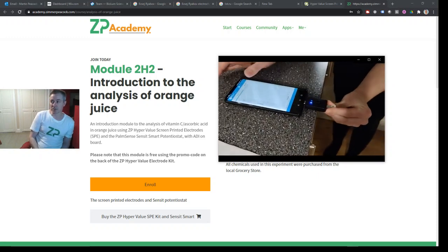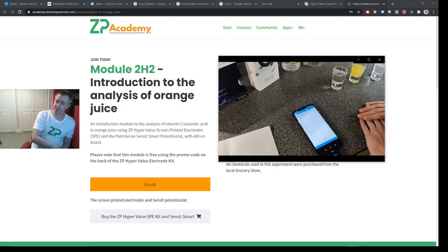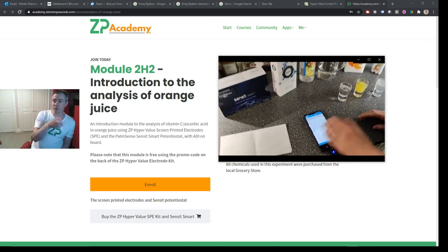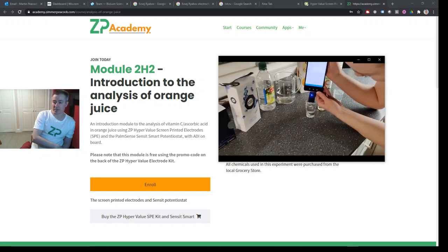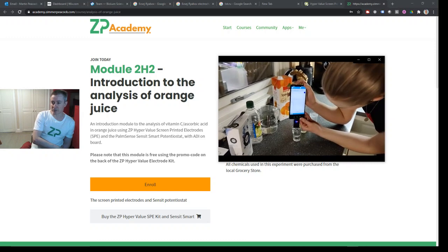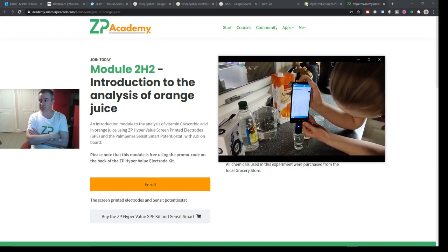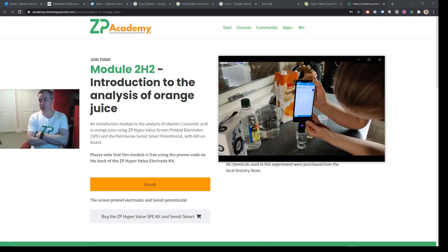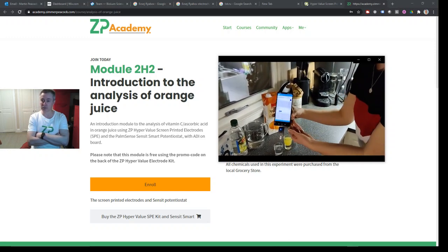In this video the engineers show you how to plug the ZP hypervalued electrode into the Sensit and how to set up the Sensit to do the actual experiment. They move across the solutions gathering a voltammogram each time. The engineers were efficient by doing a very fast cyclic voltammogram. The details about how they did this are in the course — if you enroll you'll find a video with annotation talking you through what they're up to, as well as e-notes with settings and the kind of data you can expect.